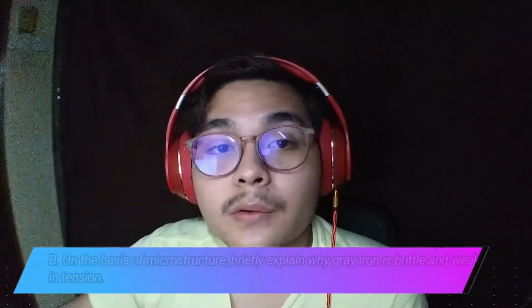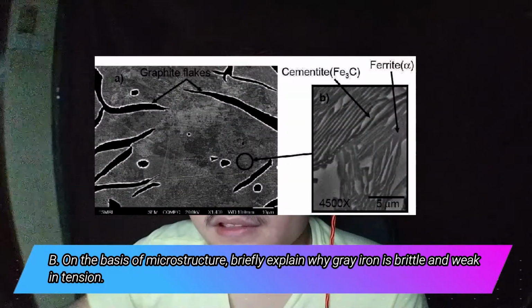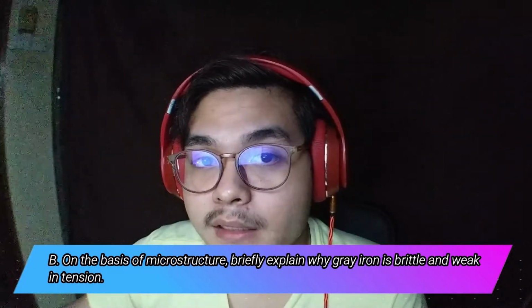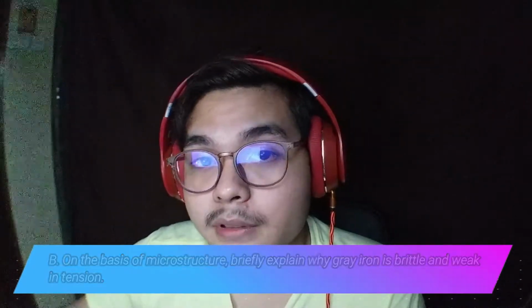Number 2. Gray cast iron has a graphite microstructure. The matrix includes graphite in the form of flakes. This gives way to weaker metal regions. It also has a poor tensile strength. This is because of the stress accumulation at the tips of the graphite flakes, making them brittle in nature.